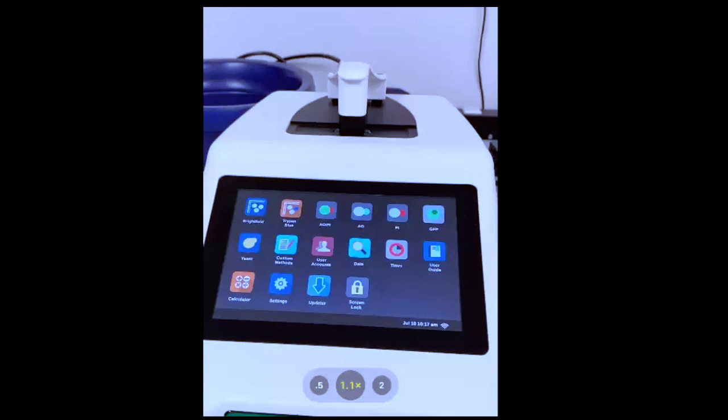Yep. How do you differentiate between live and dead cells? So there's a couple of different ways to do it. I can just do a quick sample with Trypan Blue here, since that's one that a lot of people are familiar with, to demonstrate. And then we can do fluorescence as well, so I can show you the difference between the two.